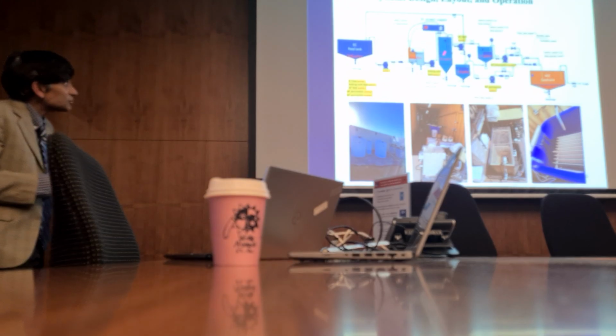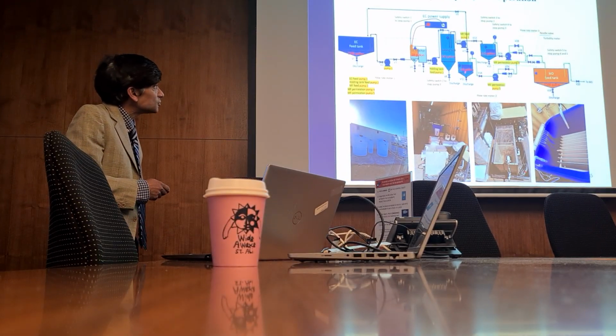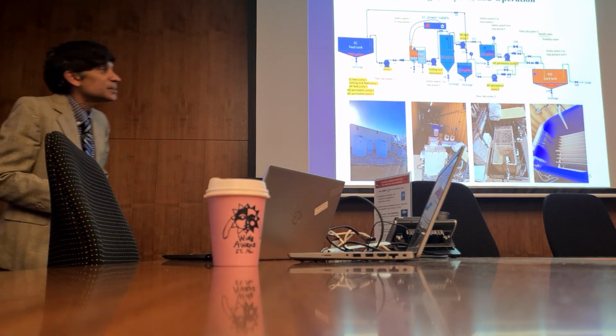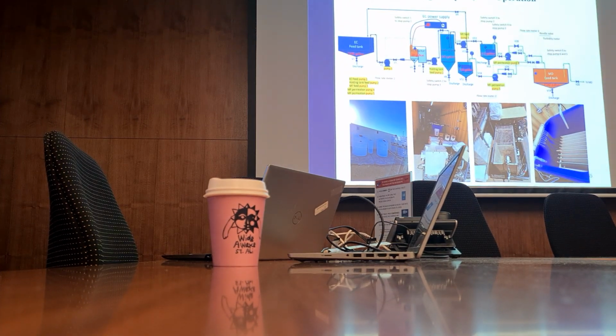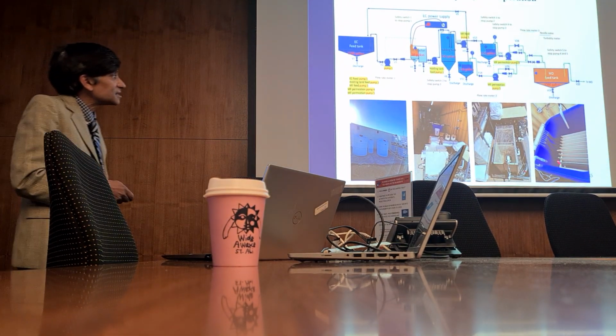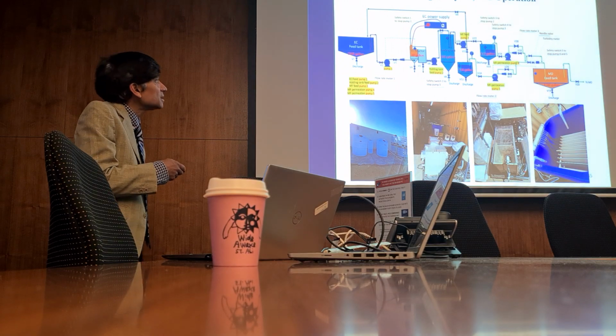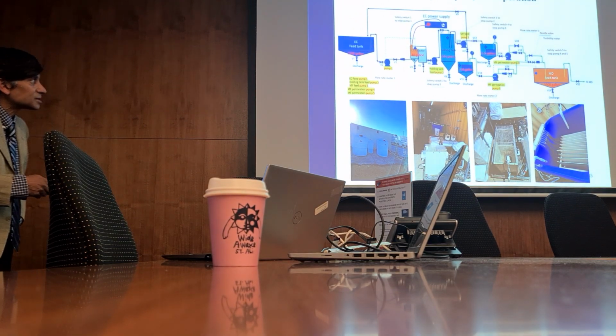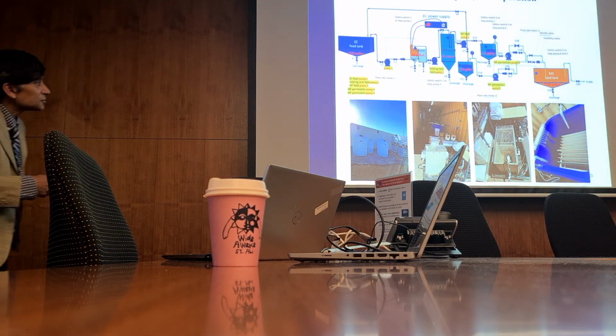From there, it goes into a holding tank and then into these two tanks, that's these blue ones here, where we have ceramic submerged membranes. So our microfiltration or ultrafiltration step was using these submerged membranes, and then the permeate from that was the feed to the MD tank, to the membrane distillation tank. Okay. There are lots of other control systems here.